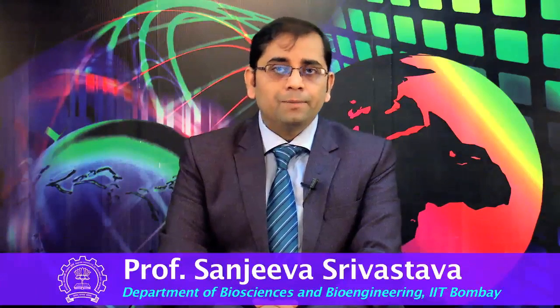I hope today you have learned why it is important to know and understand variant peptides. You have also seen how the Integrative Genomics Viewer, IGV, can be operated and accessed to understand your data. We also heard how IGV helps us find what kinds of mutations are present in a given gene by using a VCF file containing details of all the SNPs in the data. Using the details of mutated genes and type of mutation, one could create variant peptides, as Dr. Kelly had just mentioned. IGV could also be used to visualize novel expression due to splicing. You also learned about bed and bed junction files, which contain information about various possible splicing involved in a particular protein expression. The next lecture will be by a mass spectrometry scientist, Dr. Suman Thakur, who will talk about proteomics in clinical studies.